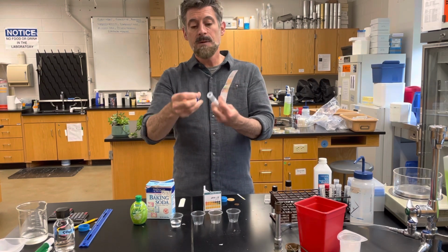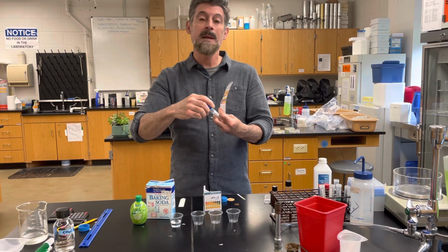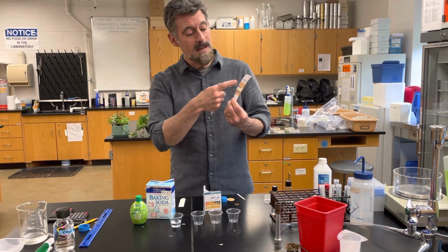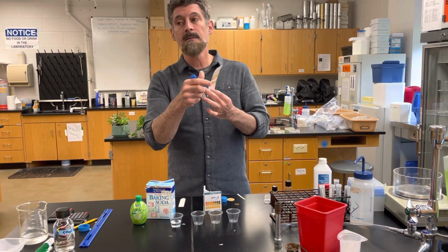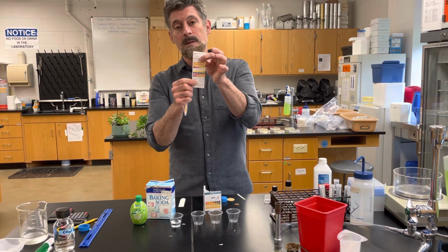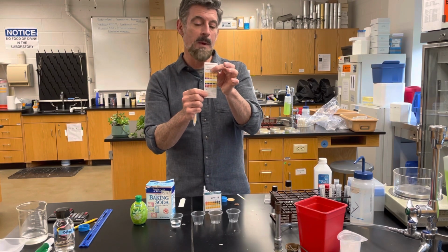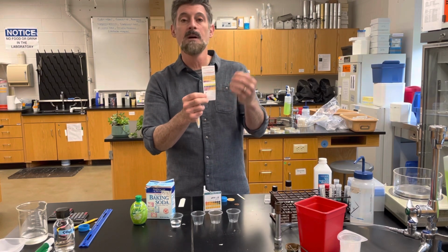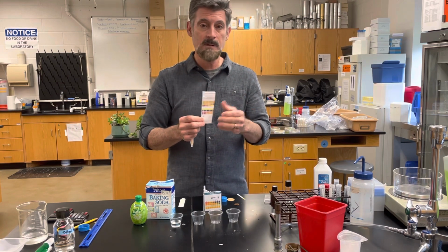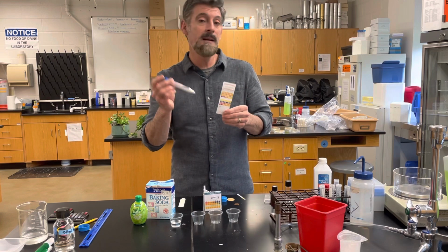What's going to happen is, once they get wet with a liquid, based on the pH of that solution, the hydrogen ion concentration of the solution, it's going to change the color of the chemicals on the different pads, and then it's going to match one of these patterns, or at least be very close to one of these patterns. And from that, you're going to be able to decipher what is the pH of that solution, what is the hydrogen ion concentration of that solution roughly. And it actually is fairly accurate.